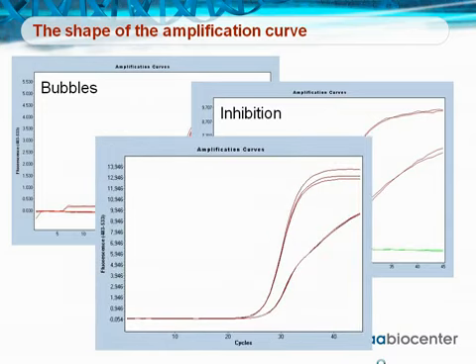This shape of the curves that you see on the right can also occur. Here, the first part of the amplification curve looks normal, but instead of going into the plateau phase, the curve goes into a linearly increasing curve. This behavior with asymmetric amplification may occur if there is excess of one of the primers that after a while, when the other primer has finished, continues the amplification of just one of the strands.